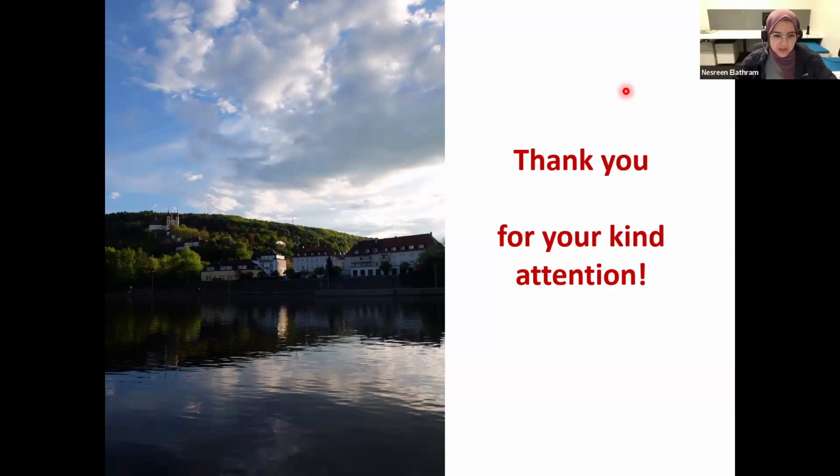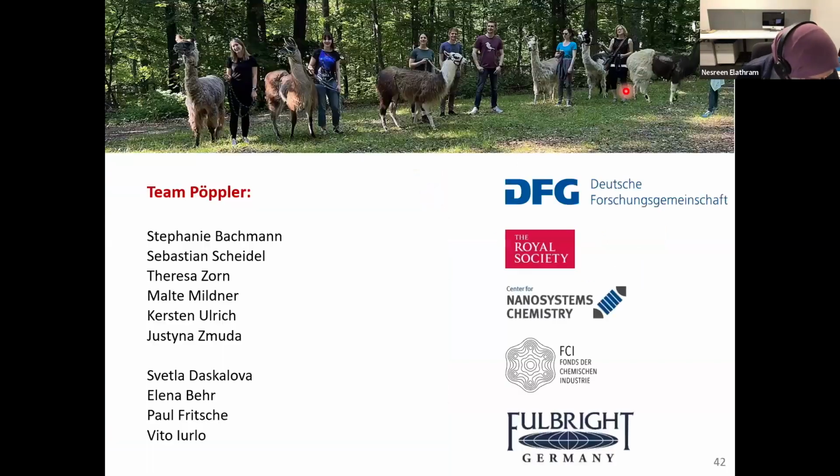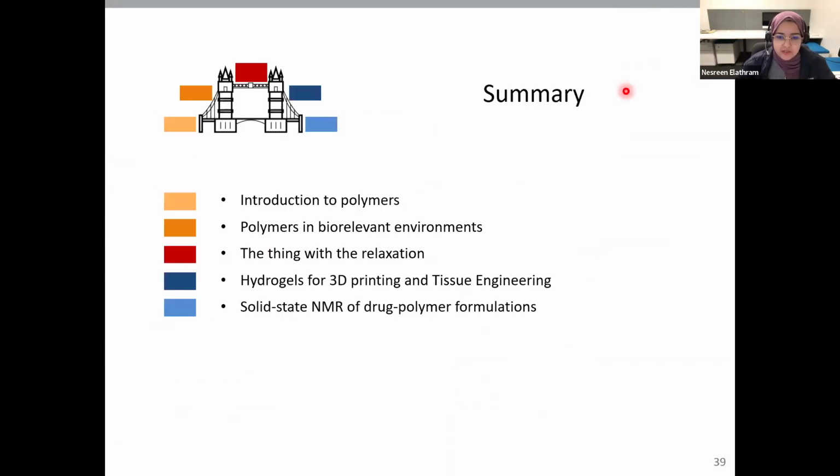Thank you so much for the great talk. Yeah, so questions. For the gelation, when you showed the gelation of the polymers after adding the drugs, can you track this? Like, is it sudden, or could you track it with the solid state NMR? Does it take time to make hydrogels, or is it very fast?